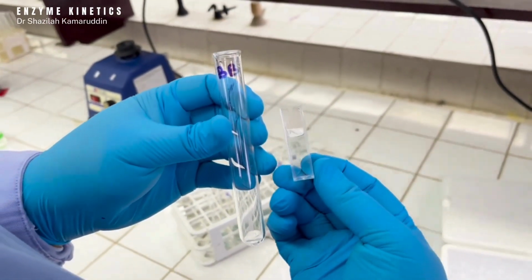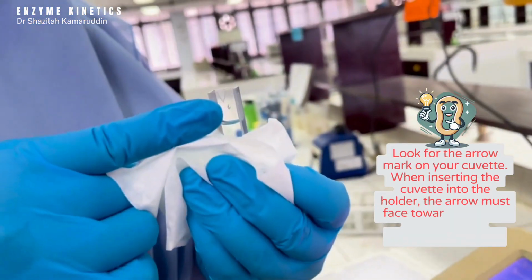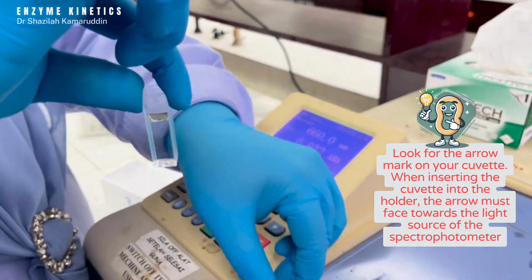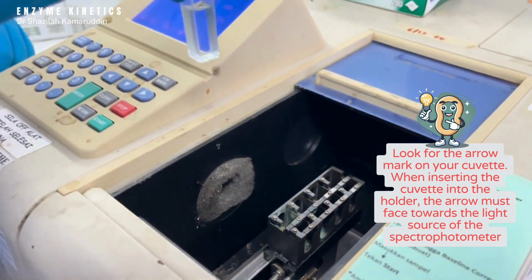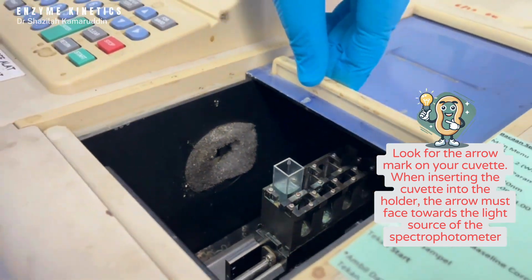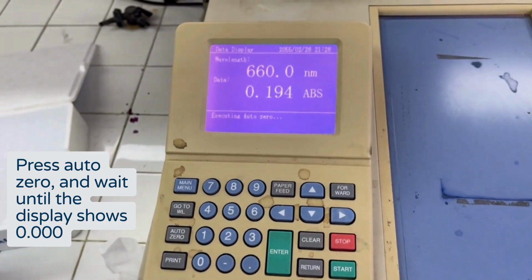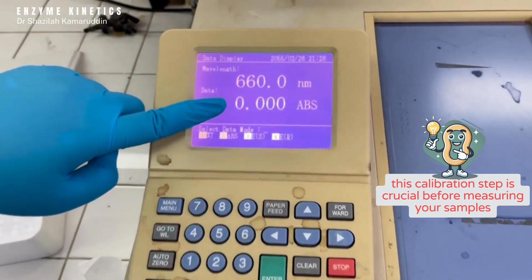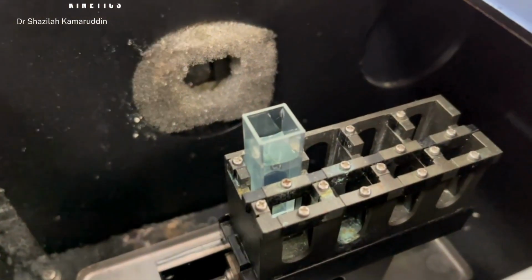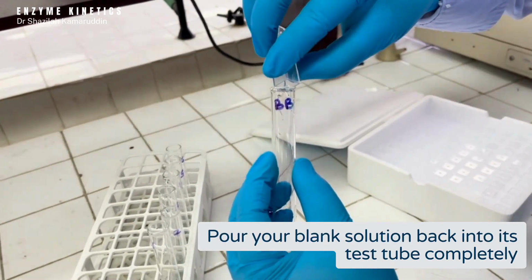Insert your blank/control tube into the cuvette holder. Press Auto 0, and wait until the display shows 0.000. Take out the blank cuvette. Pour your blank solution back into its test tube completely.